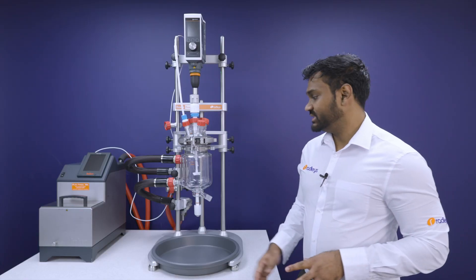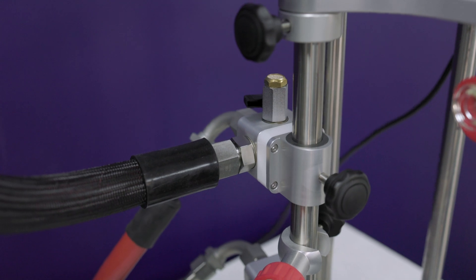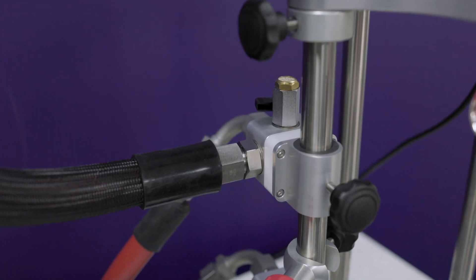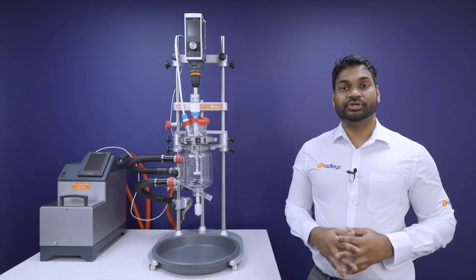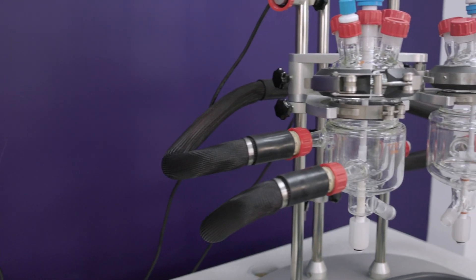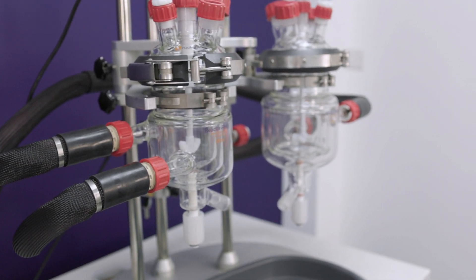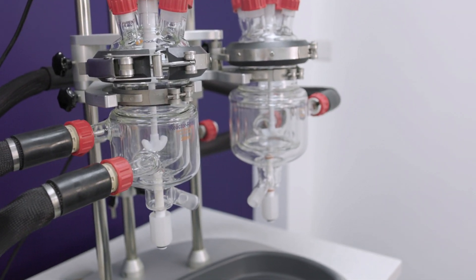We attach the circulator hoses to manifolds at the back so these don't have to be tightened every time, and vessel jackets can be easily drained of oil. This means you don't need to fill your lab with separate frames for different reactor sizes. If you do want to have several reactors running in parallel, the Duo is a nice solution for getting two reactors on a very compact footprint.